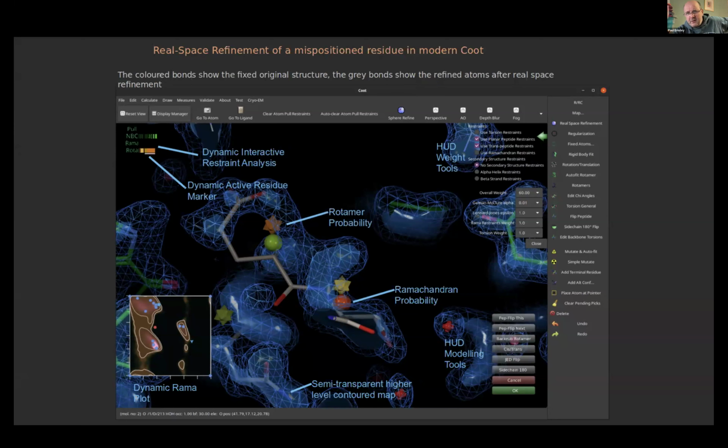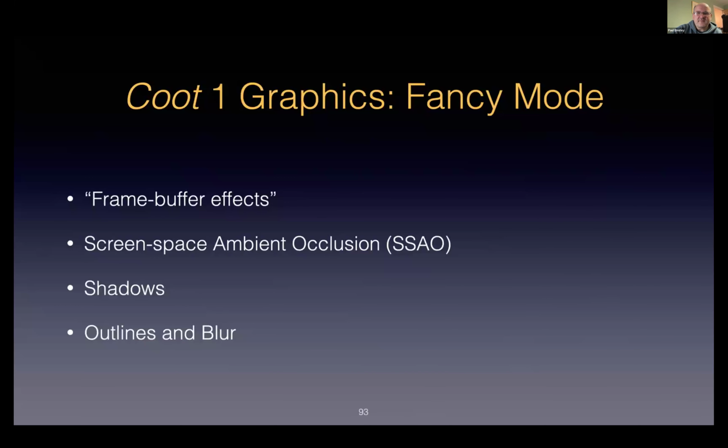It's not actually health bars, it's damage bars. So the idea is there to allow you access to move around the structure looking for problematic geometry. Like you've been shot in the arm, and you need to get your med kit, and so that's the idea. So you can navigate to that place and then fix the problem.